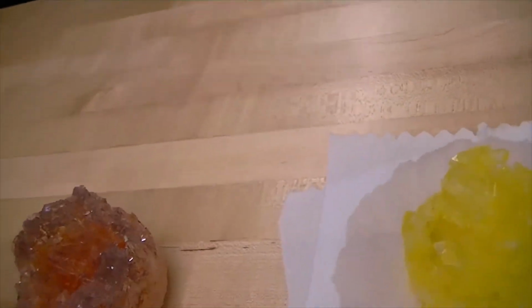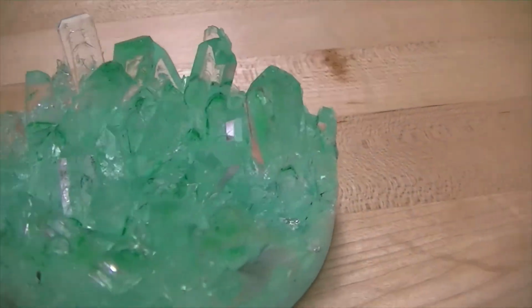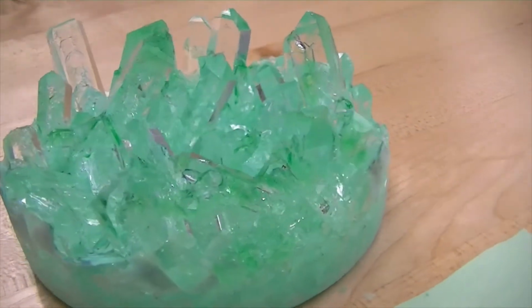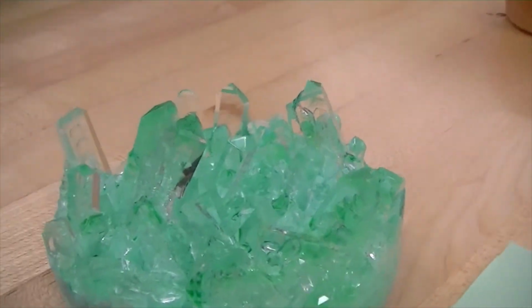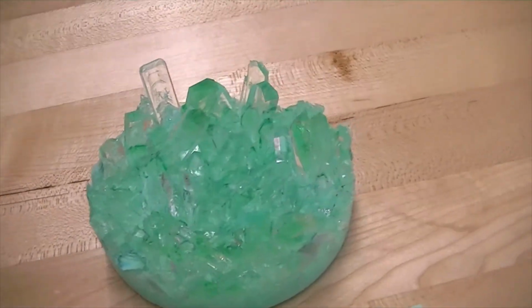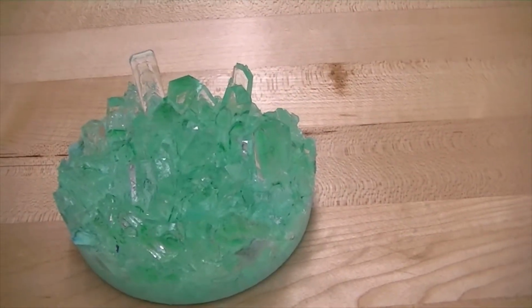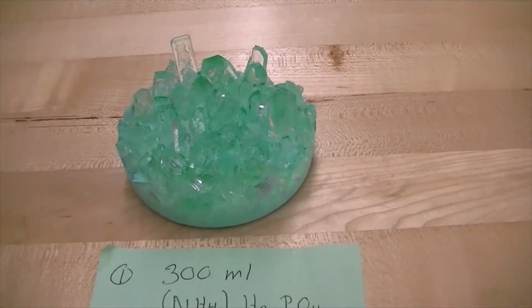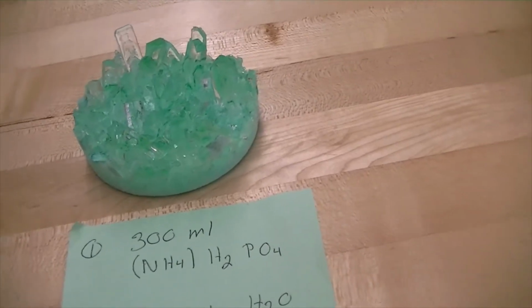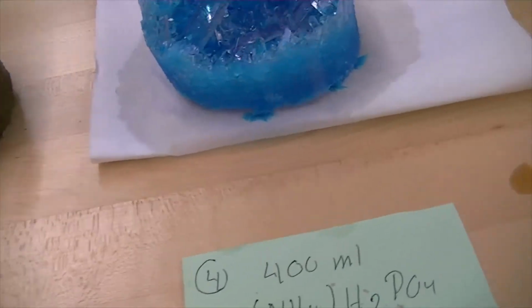And also, I was pretty impressed with the crystals that came from the 300 milliliter solution. So these are some pretty nice crystals. Nice form to them, nice prisms. And that was at a much smaller amount. I was looking for a static looking crystal, a crystal that to me was really nice looking. My favorite, and this is my personal bias, would be number 1, the 300 milliliter. And I also like the 400 milliliter.